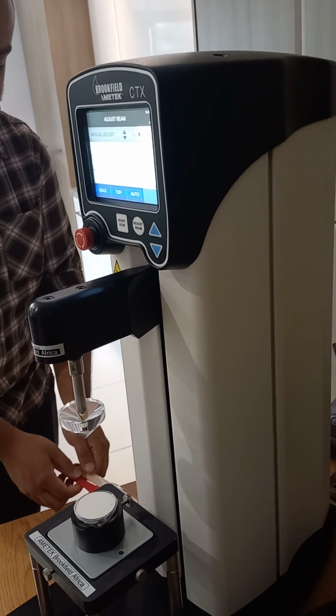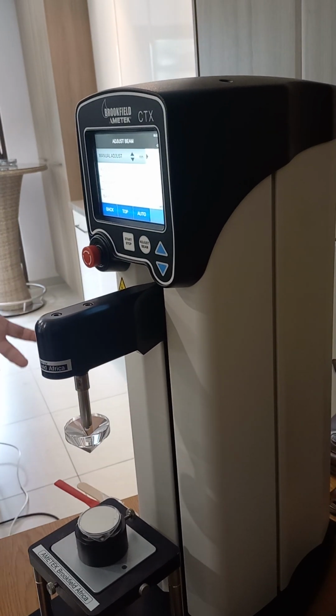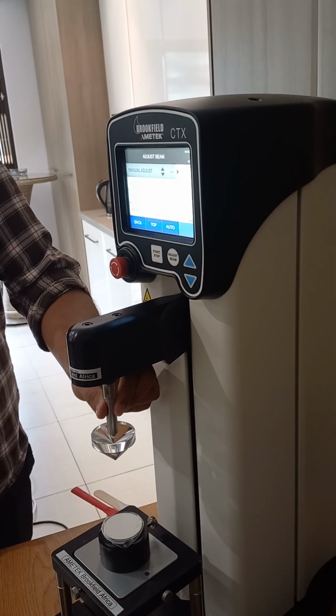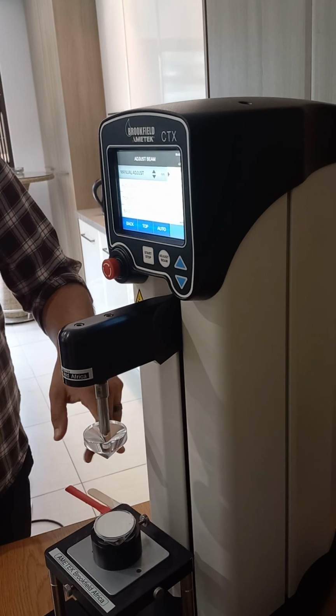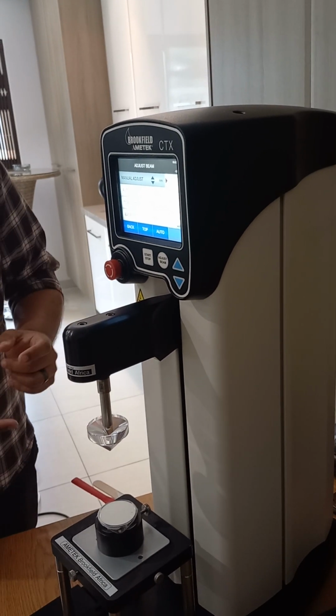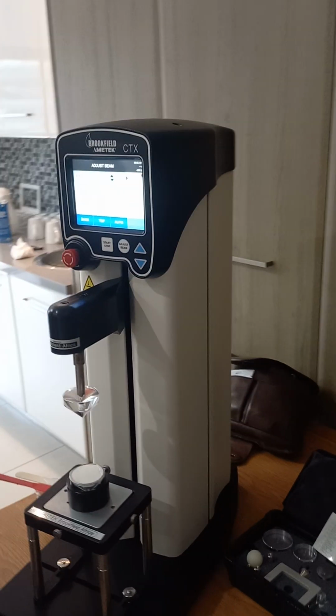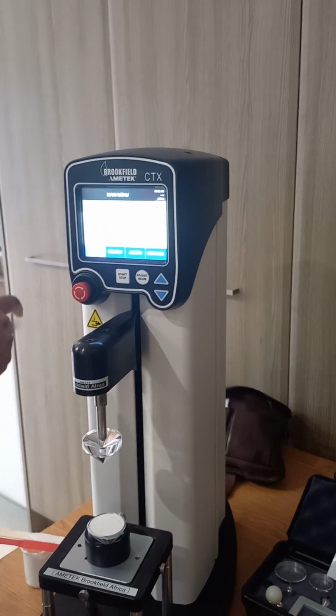Okay, so the test fixture that we have here, we're testing for spreadability, so this is called the spreadability test fixture. We have a cone-shaped probe that will go into this little cup that basically is the same shape as your cone. Right?